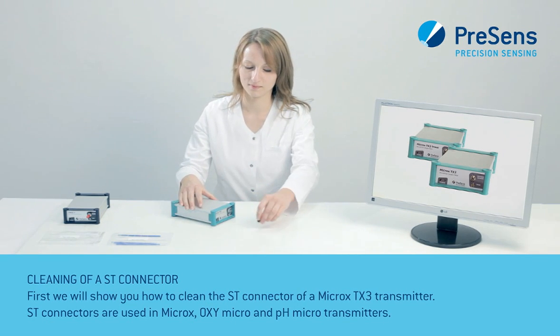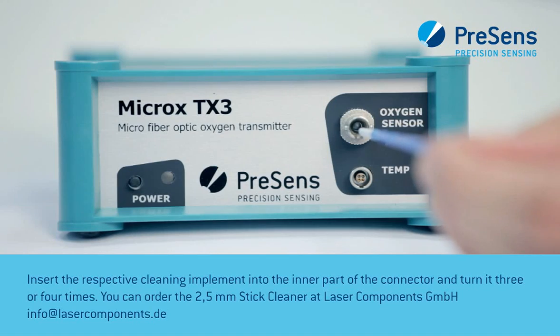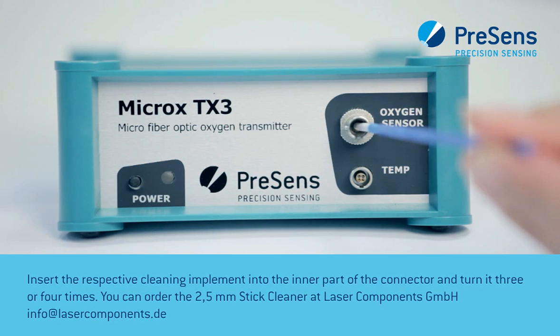ST connectors are used in Microx, OxyMicro, and PHMicro transmitters. Insert the respective cleaning implement into the inner part of the connector and turn it 3 or 4 times.